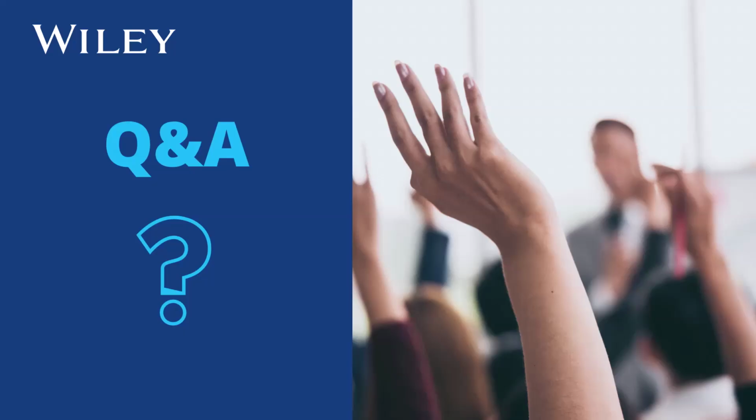Hello, thanks, Mark. Okay, let's get started here. So how does a user access the libraries in the KnowItAll software? Michelle, do you want to take that? Okay, I can take that. Of course, you purchase a license, and then you can access the database from KnowItAll either by downloading the database ahead of time or waiting for KnowItAll to download it for you and just opening the database. That's it.